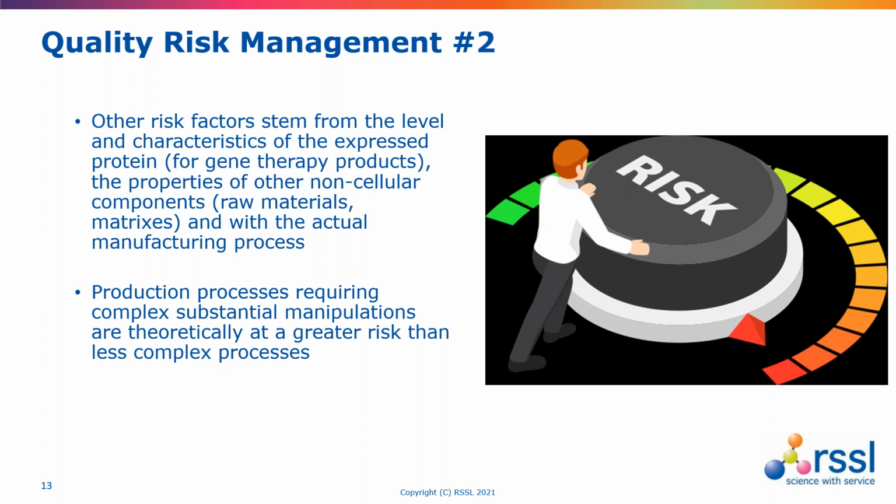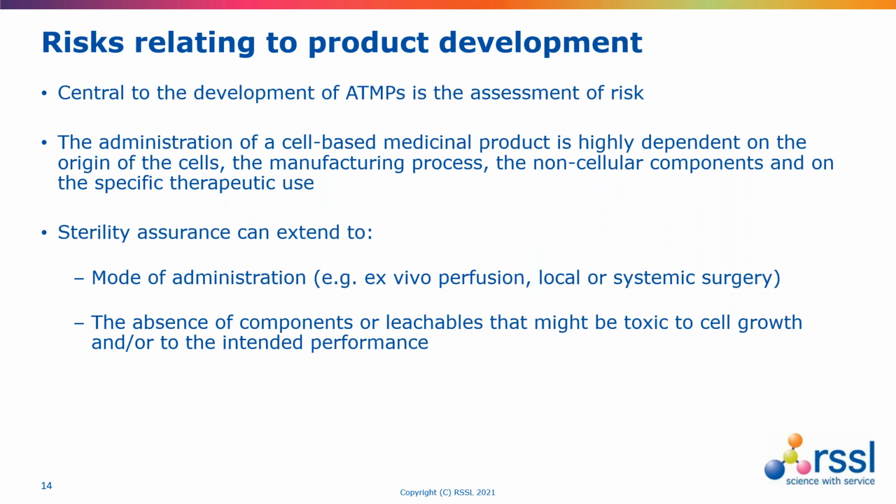And in terms of these sorts of controls, it's good practice that the development program tries to address some of the risks. So in terms of choices, materials and types of processes that are there to be scaled up into main production, these should be addressed from the point of view of the biological or therapeutic function, the maintenance and the protection of the cell population.